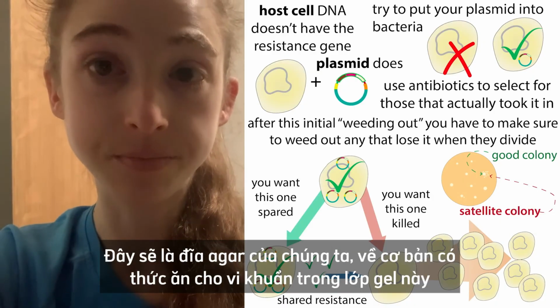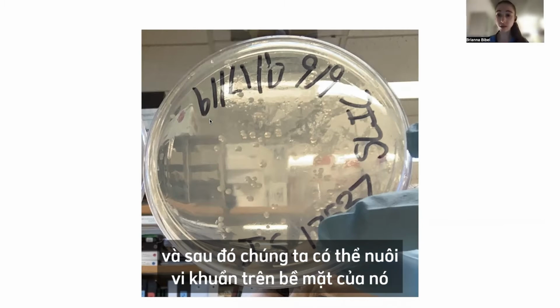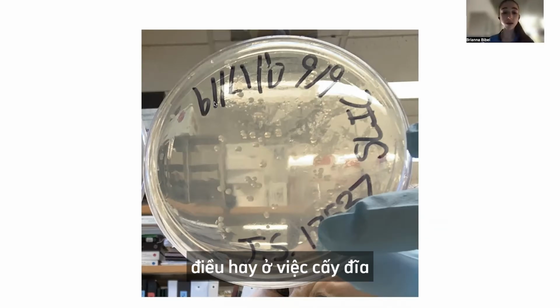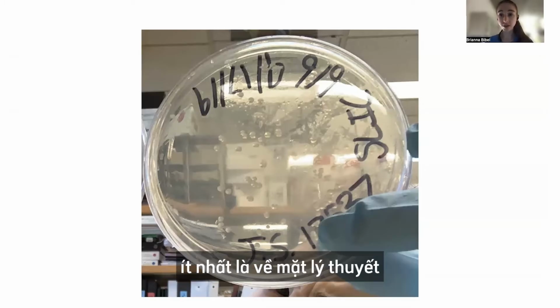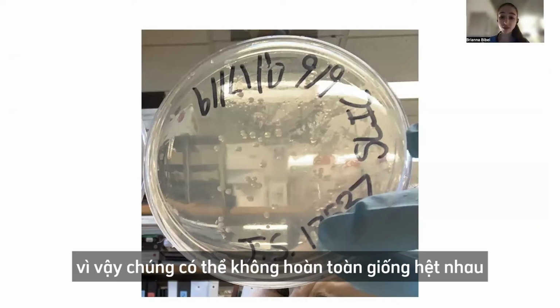So let's dive in. This will be our plate. Basically there's bacteria food in this gel, and then we can grow bacteria on top of it. Or we could also grow bacteria in suspension, and in both of these cases we use antibiotics. What's nice about plating is that you get distinct colonies where each of these spots represents a single genetically unique population of bacteria, at least in theory. In reality, there can be little variations, so it might not be all exactly the same bacteria.